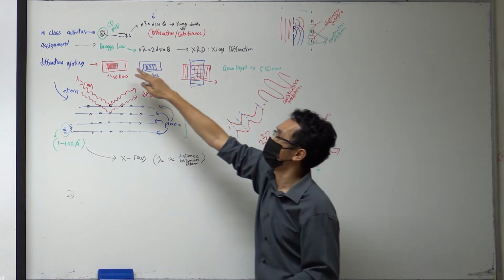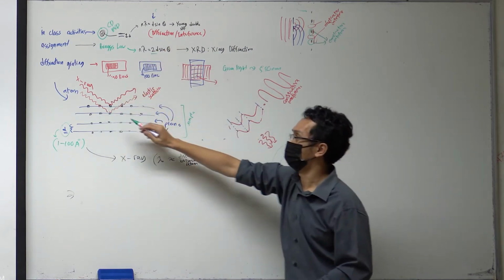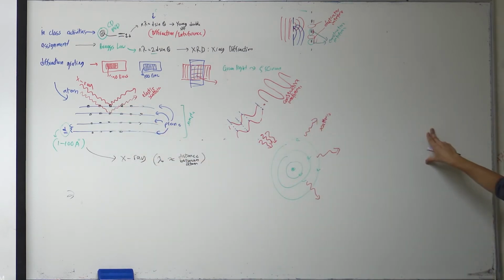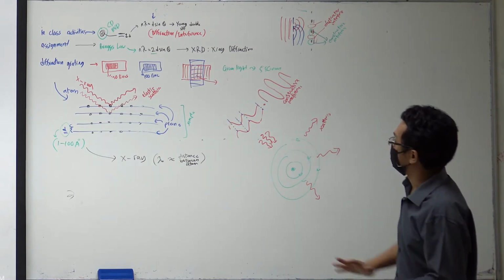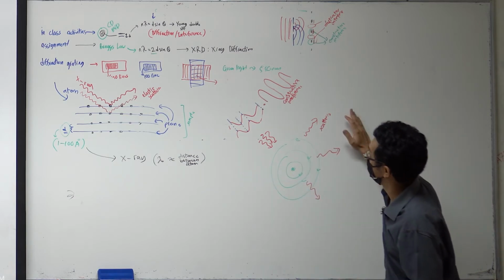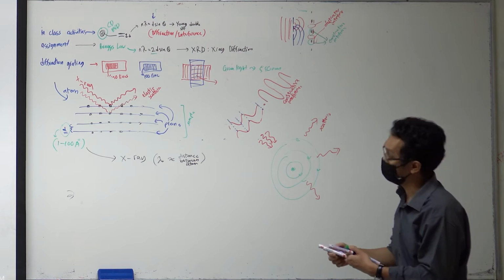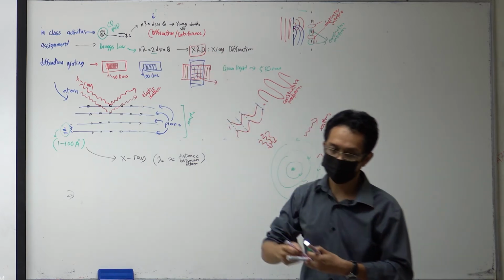And you have done in the assignment why there are two, because you have this thing. So I will not discuss that because you have done your assignment. But the idea is that you use X-ray to probe this thing. And when you use X-ray, the tool is called XRD.